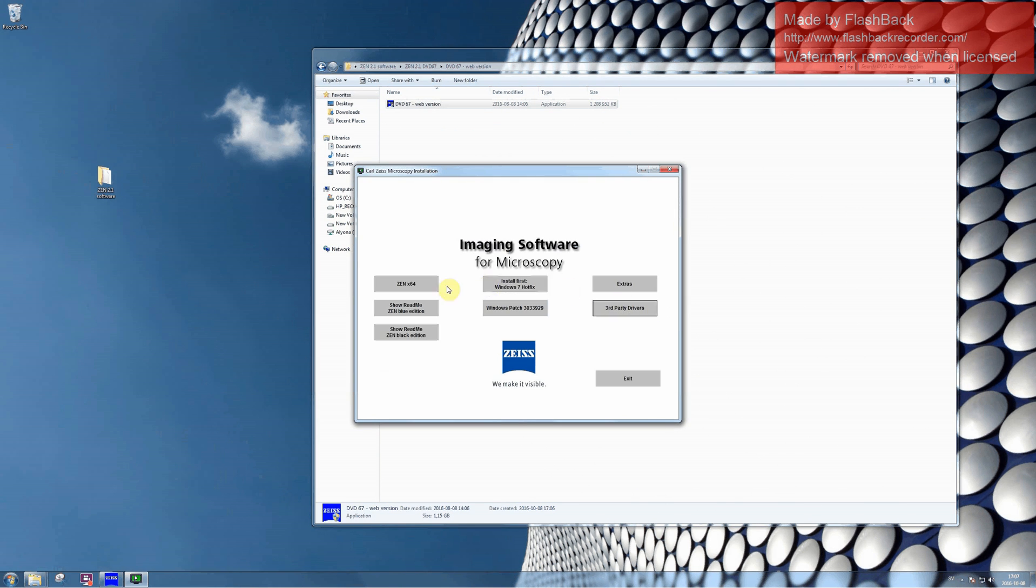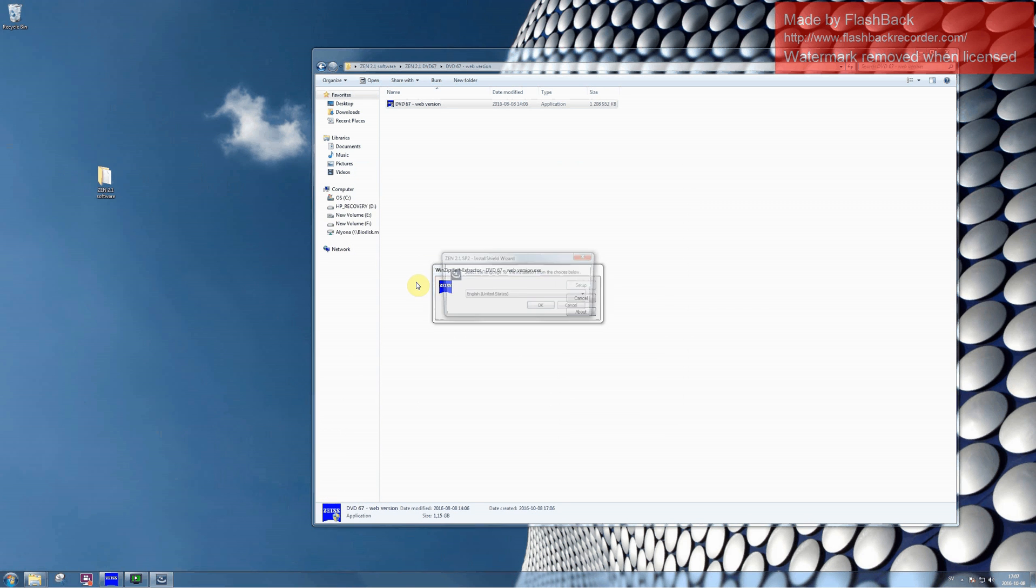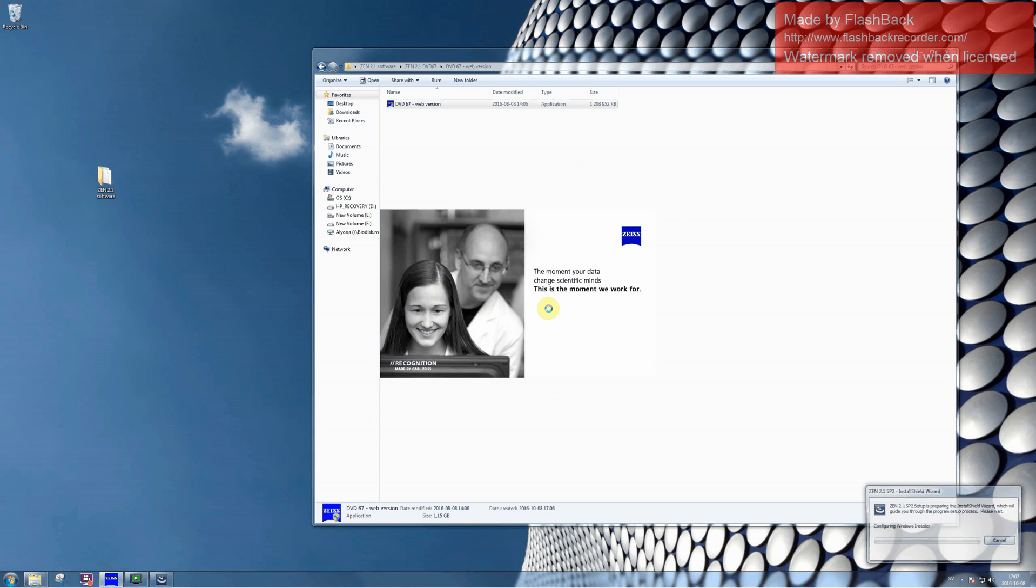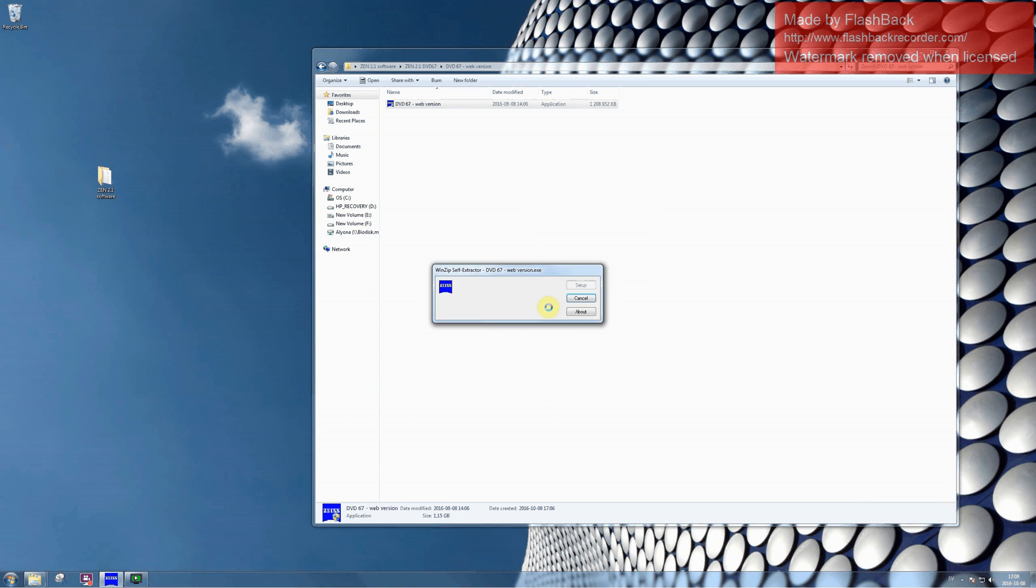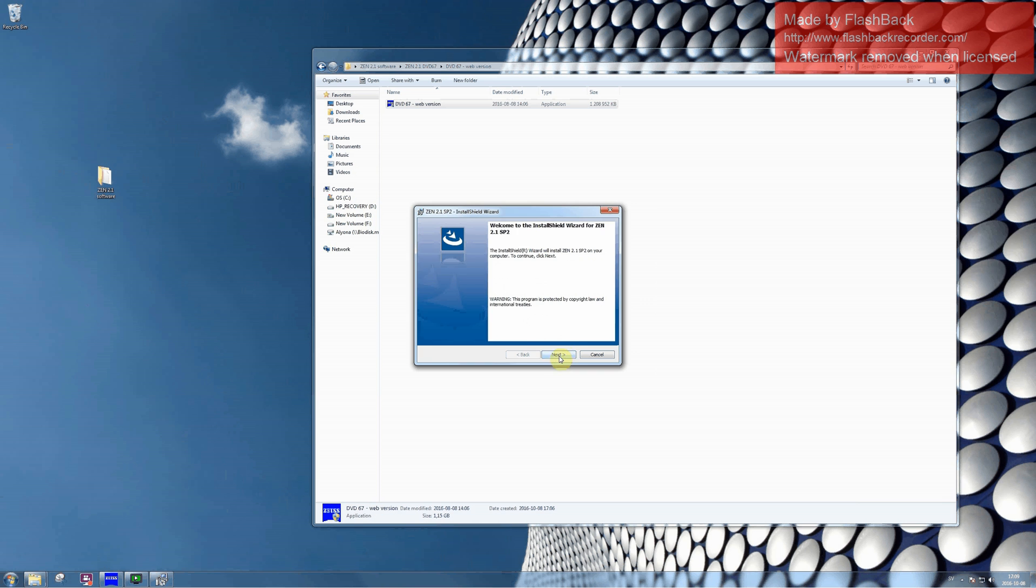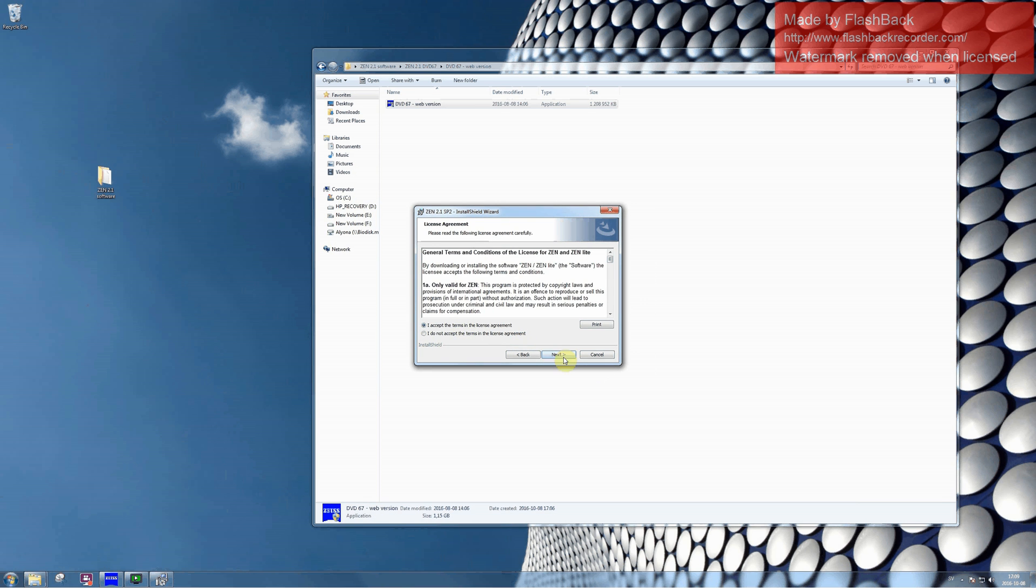Proceed to the button called Zen64. Here you can pick the language which you prefer. Proceed by clicking on the button Next and accept the license agreement.